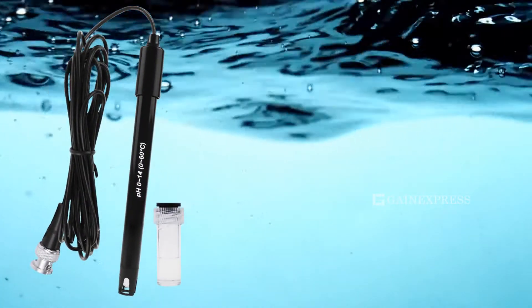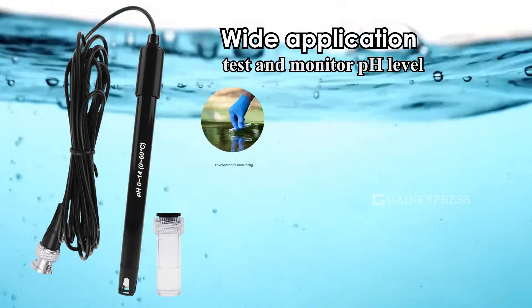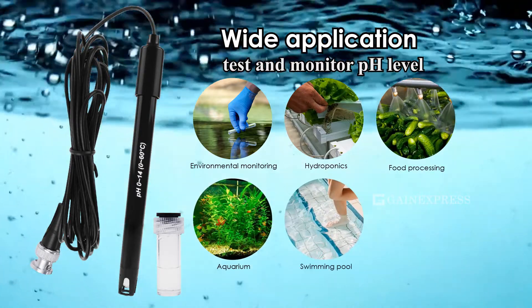This replacement pH electrode has wide application — it can test and monitor pH level, environmental monitoring, hydroponics, food processing, aquarium, swimming pool, and laboratory use.